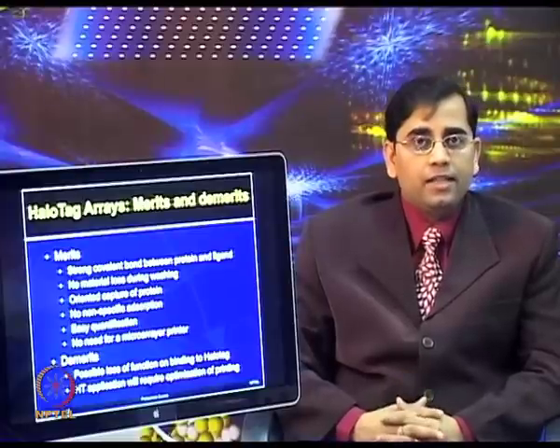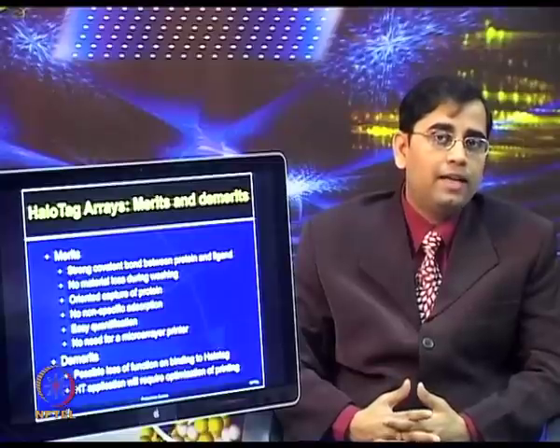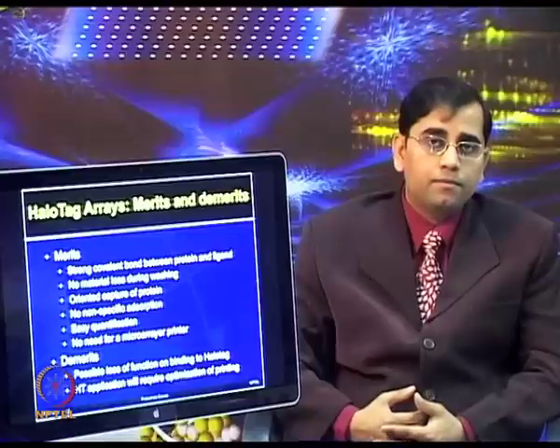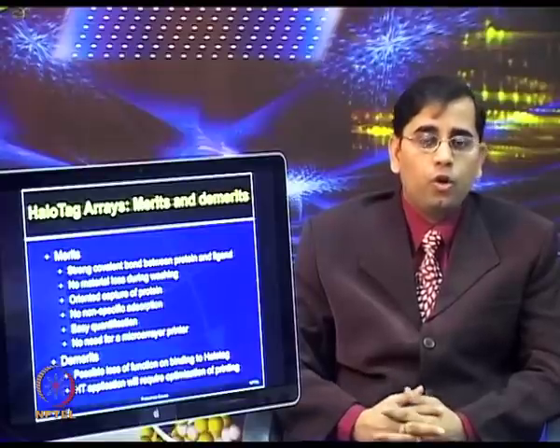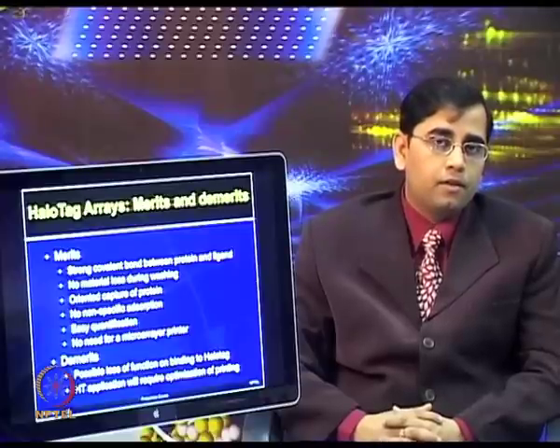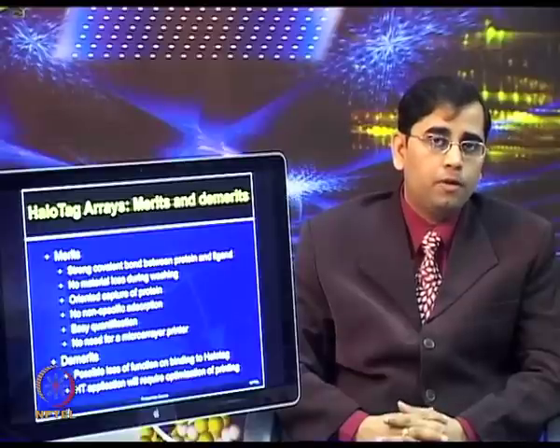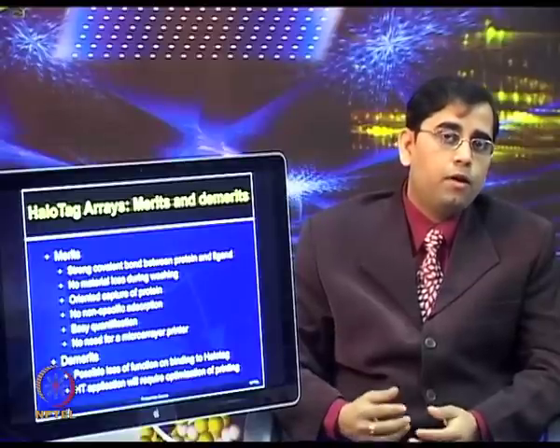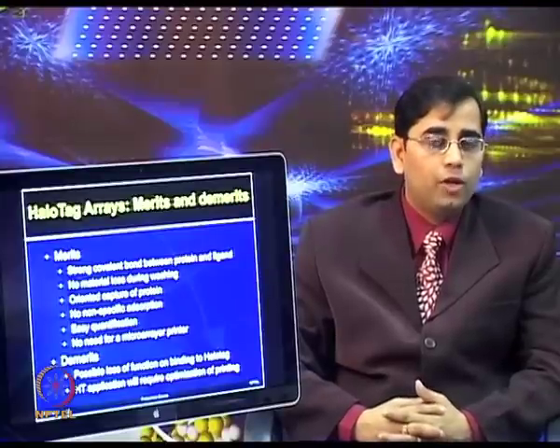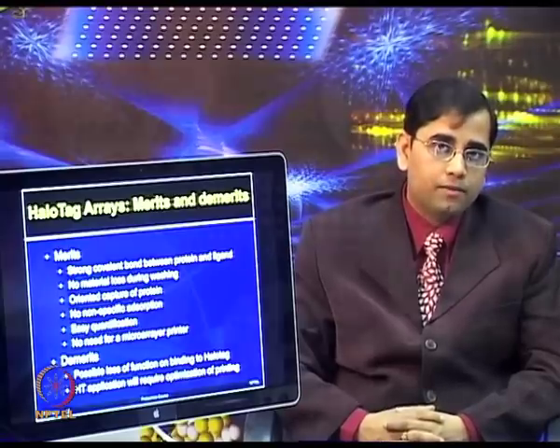So, high density arrays in theory are possible, but one needs to ensure that even at high density these arrays function properly. Then there is possibility of loss of function on binding to the HaloTag. So, these types of quality control checks have already been performed, but still more biological questions need to be addressed on these arrays before one feels confident on applying these for various clinical applications.